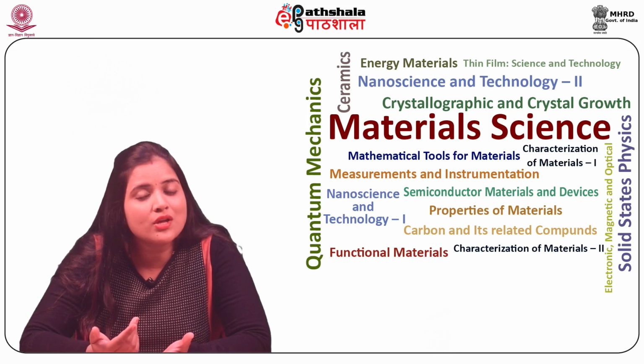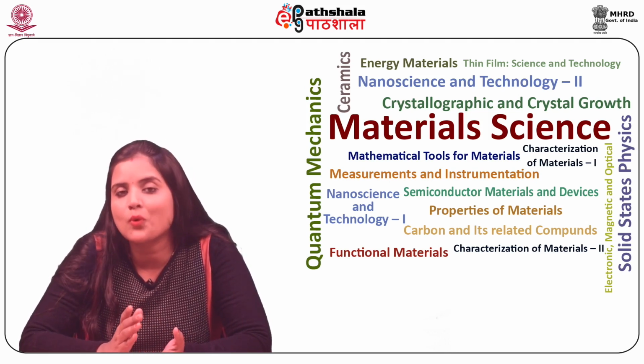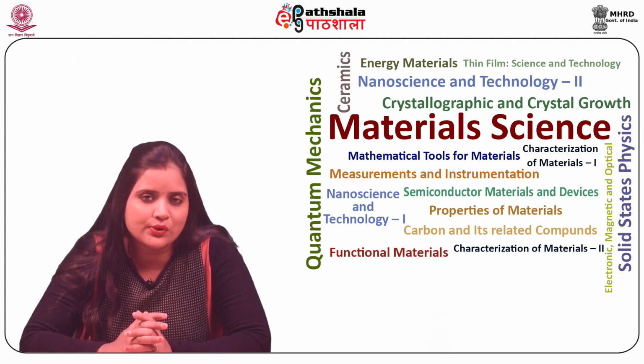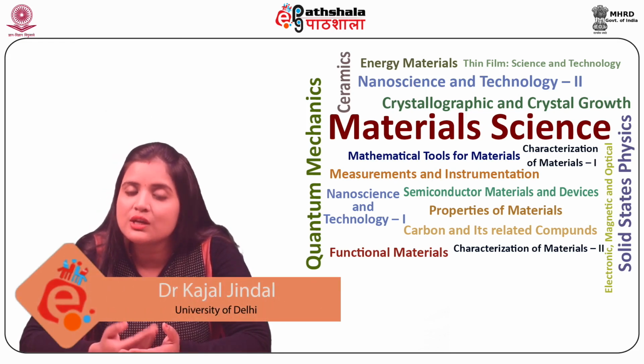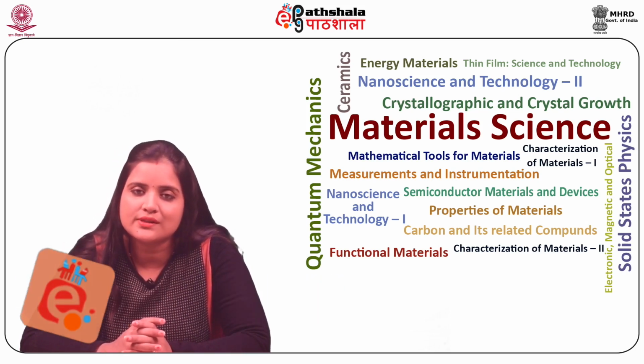Instrumentation and working of the total internal reflection fluorescence mode, that is TIRF, of fluorescence light microscopy was discussed in detail. Finally, the advantages, limitations, and applications of fluorescence were discussed.